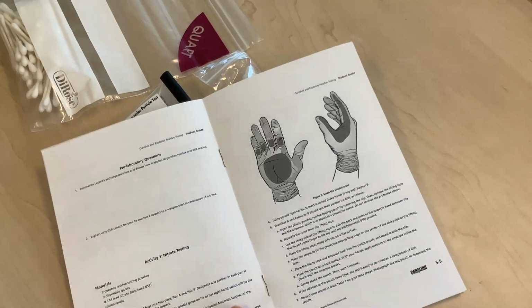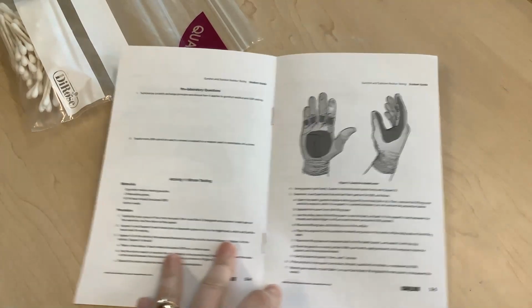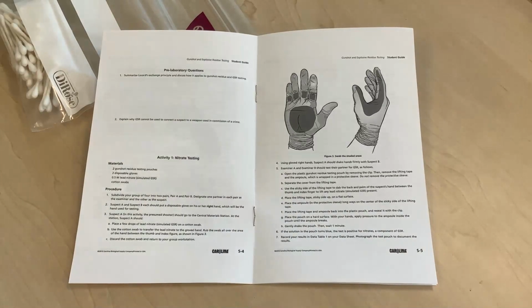Okay, so this is our lab on gunshot residue. The first thing we need to do is we need a group of 4. Two people will be the suspects and 2 people will do the testing.